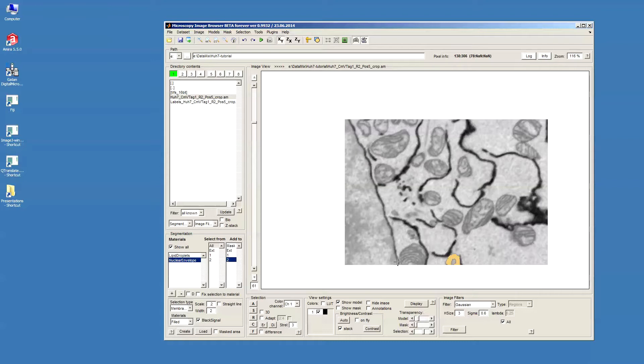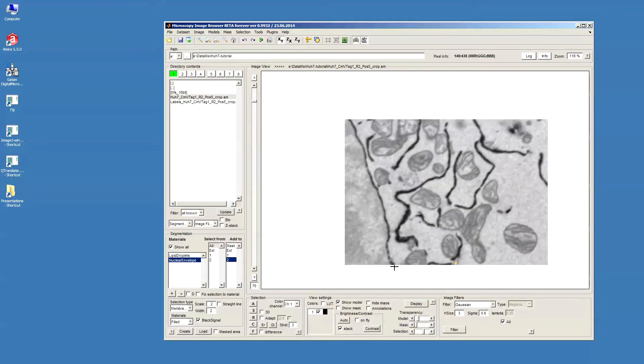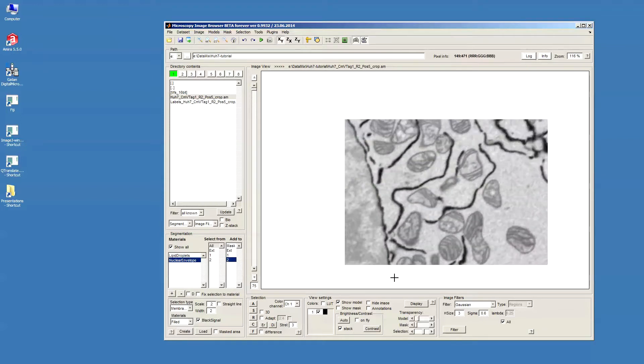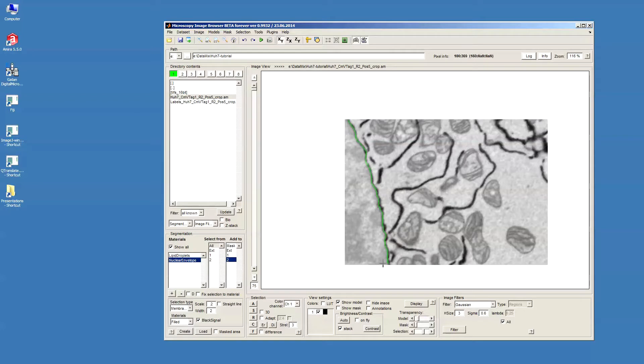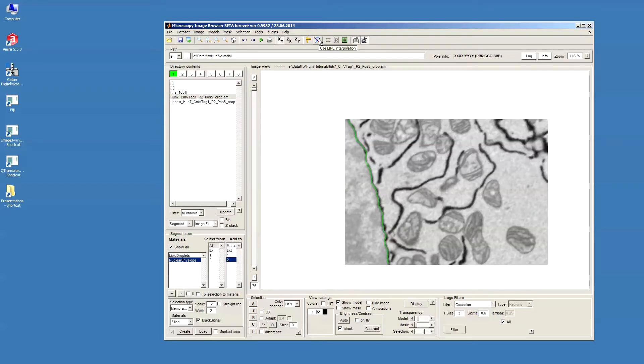Let's continue further. When we finish this drawing, we should check the interpolator. Now, we've selected the shape interpolator, but since we have some kind of a line profile here, I think it would be much better to use line interpolator.